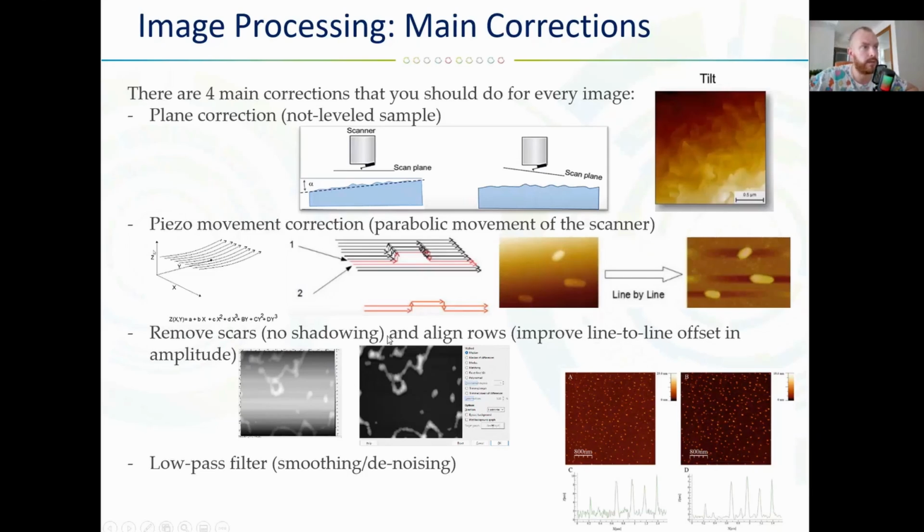So this is our today's sample. You see there are some lines, a little bit less, a little bit more, a little bit shifted, but at the end it's a nice image, even a bit more sharpened than on the left side. You have high frequency noise and low frequency noise. And high frequency noise you can isolate by simply putting some metallic cover and so on.